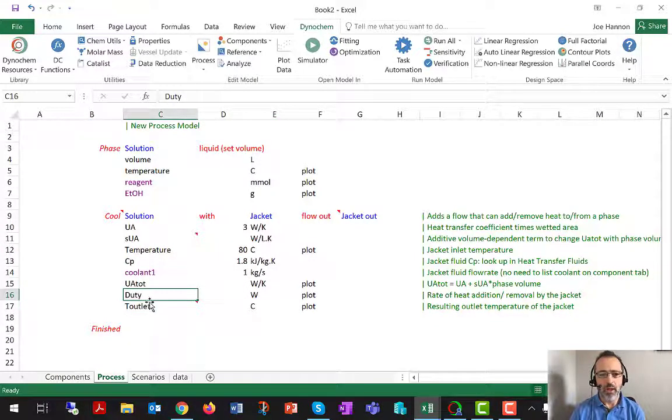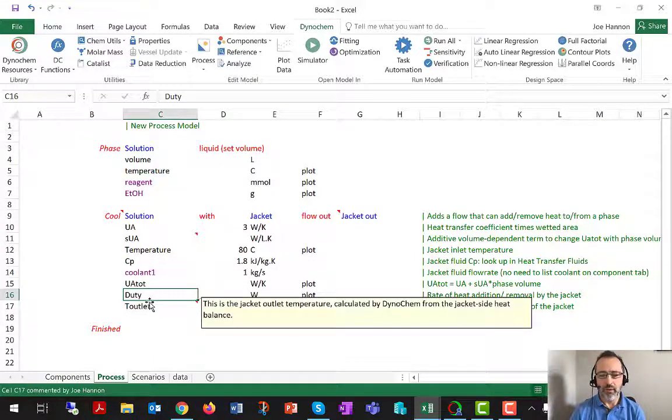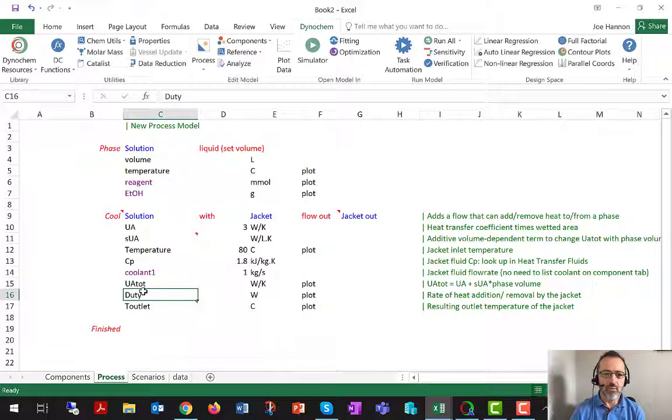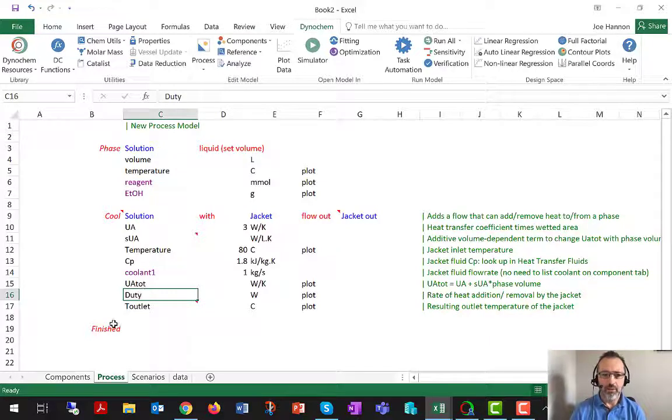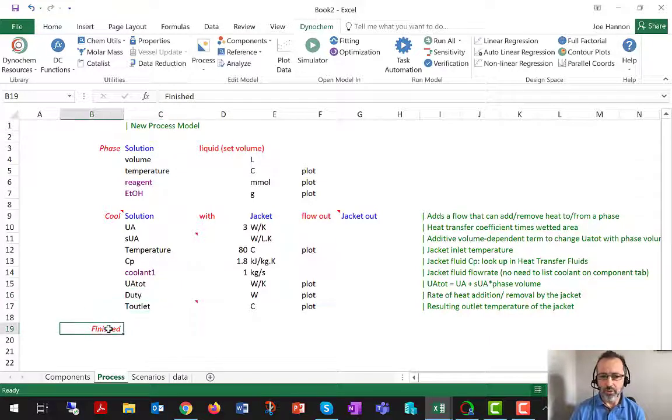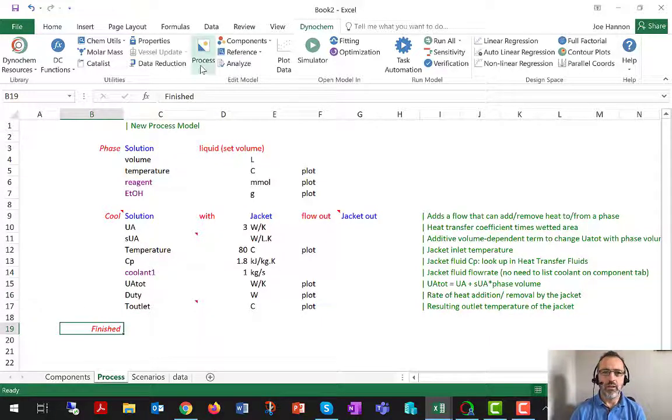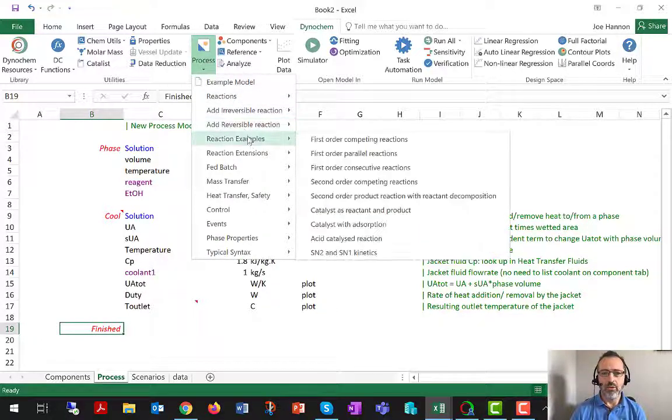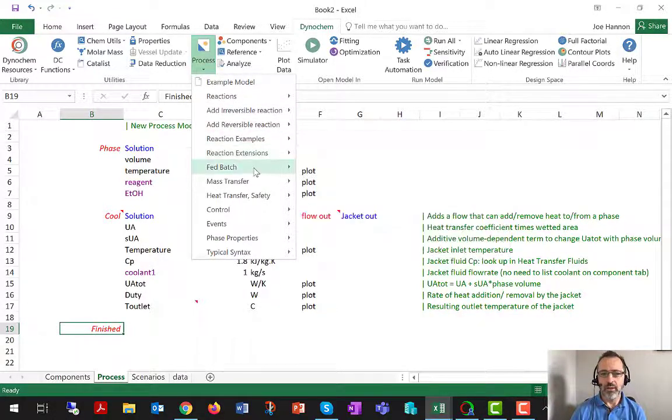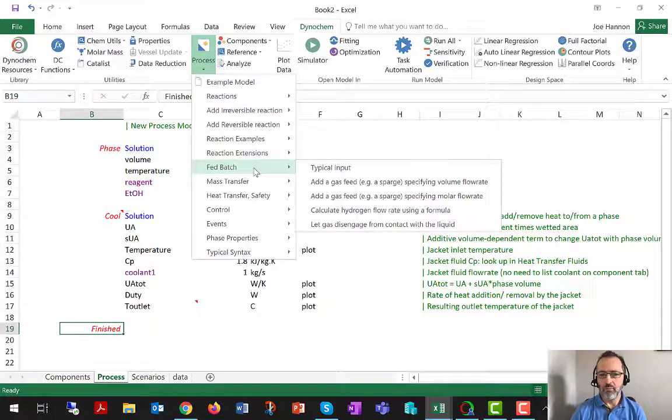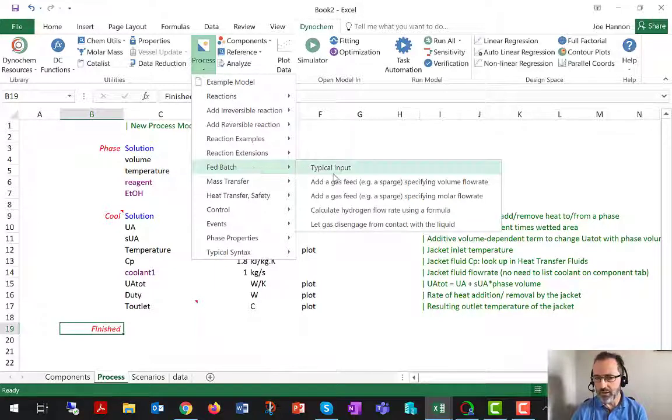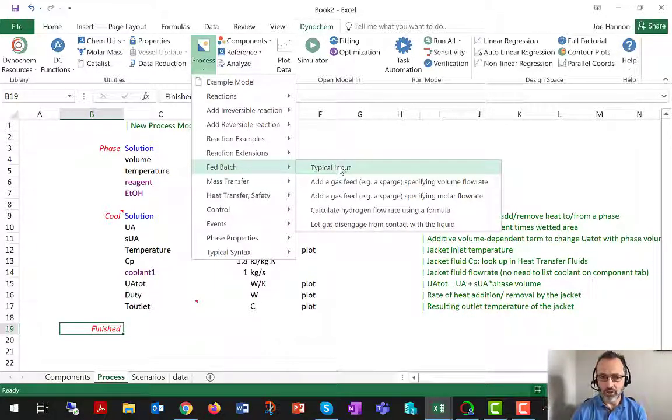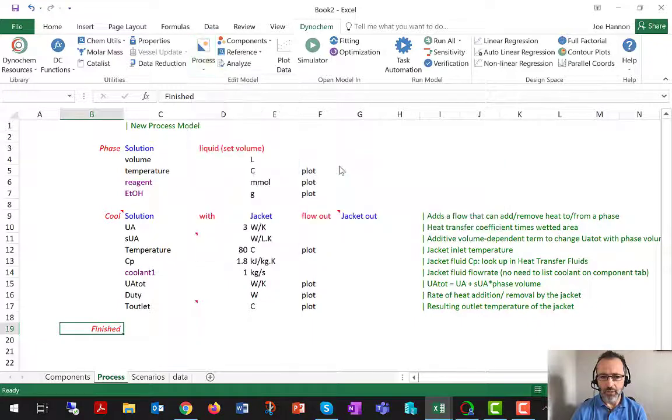Now we're going to add something else to the system. Quite often in a problem like this, it will be necessary to add a feed. So once again, I'm going to go to the finished keyword and to the process item, and I'm going to choose to make this system what we would often call fed batch or semi-batch, with a feed tank and some addition of material from the feed tank.